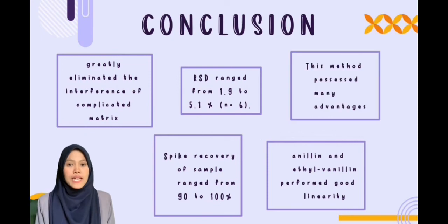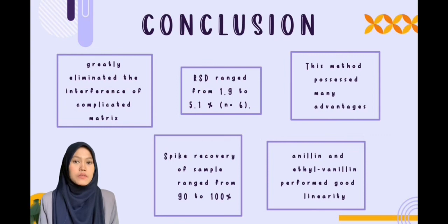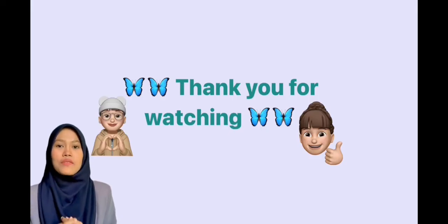We also find that this method possesses advantages in terms of high analytical efficiency, convenient operational process, and wide linear range. Therefore, the validated method is suitable for rapid determination of vanillin and ethyl vanillin content in milk powder.